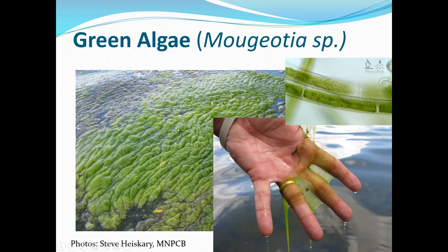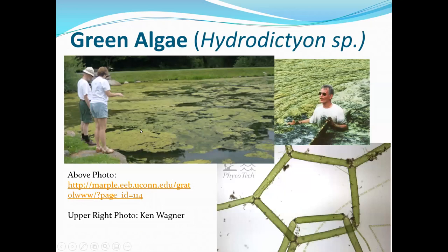Here's the issue though. This particular sample, even though it is clearly dominated by greens, that is a green and that is green. In the background of this image, there had been a dog death. That's why Steve had sent me the sample. And in the background of the image was Dolichospermum. There was Dolichospermum that was all spread throughout the sample.